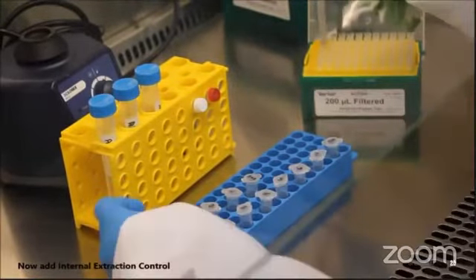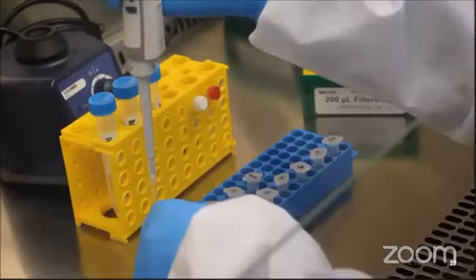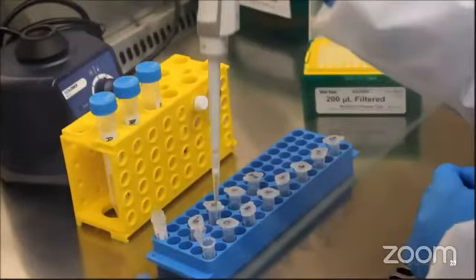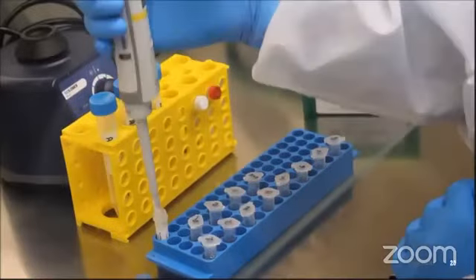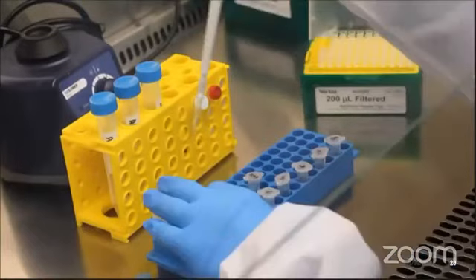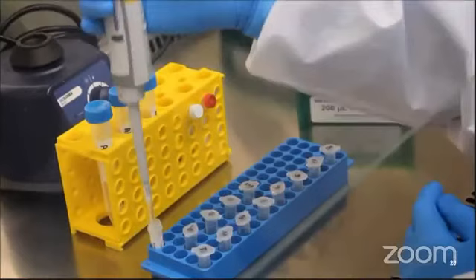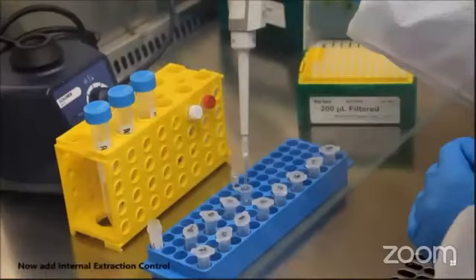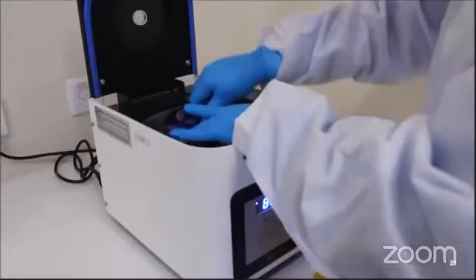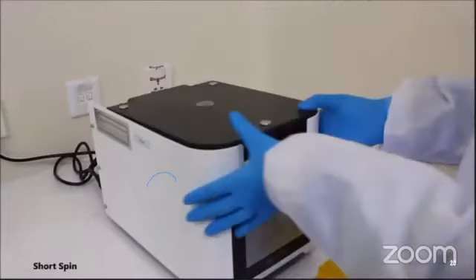The signal derived from the internal extraction control confirms the success of the extraction step. It can also be used as a quality check for the presence of any type of inhibitor during the real-time PCR reaction. The control RNA is also co-purified with the sample RNA, and it can be detected as an internal extraction control. Now the short spin.